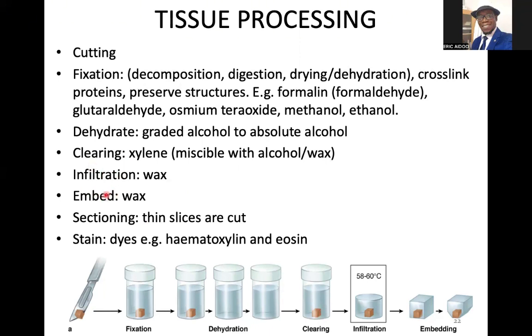Then you embed also in wax. Okay, so this is the embedding. Embedding is to give the structure some body or weight or covering. For the tissue is quite small, so you need to hold it within a body. Okay, and the wax plays that role.